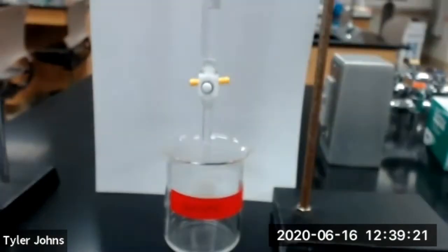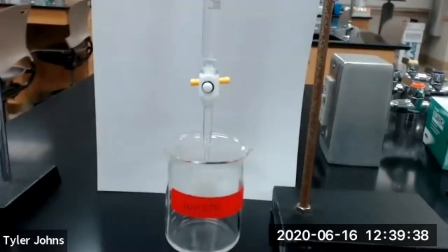And now we will record the reading to the 0.01 mark on the burette. Our burette will then be prepared to start the titration. You now need to record the reading to the 0.01, and our burette is now prepared to start the titration.